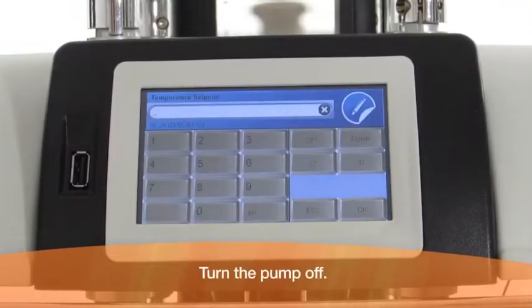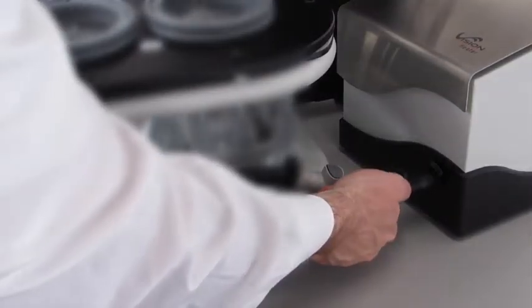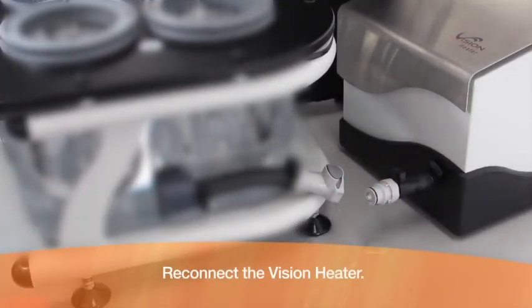Turn the pump off. Reconnect the Vision heater.